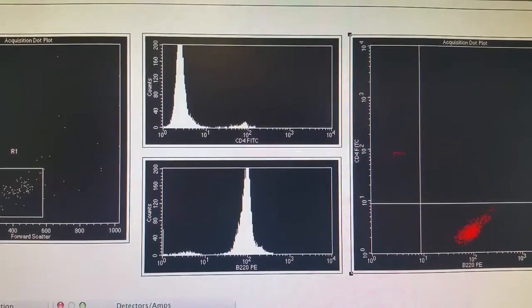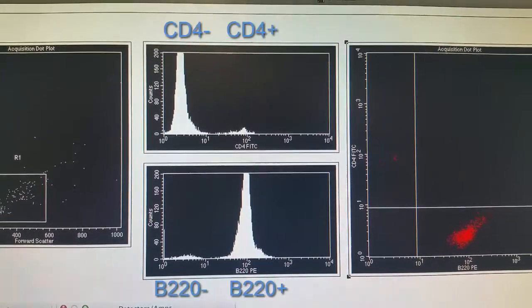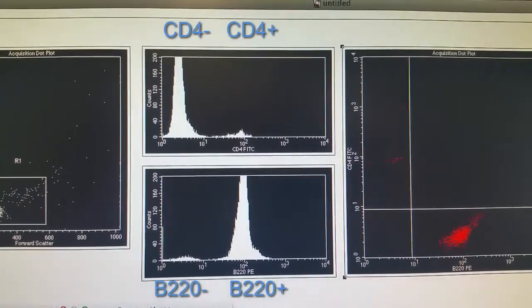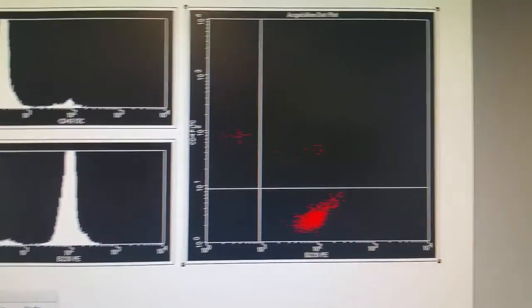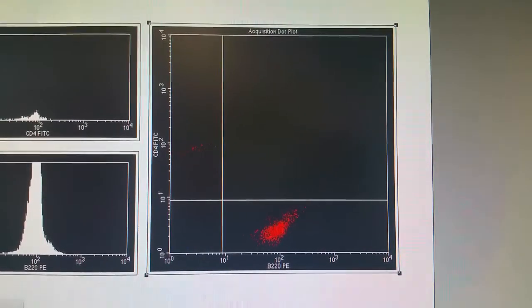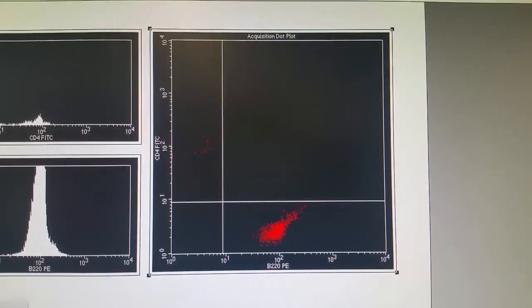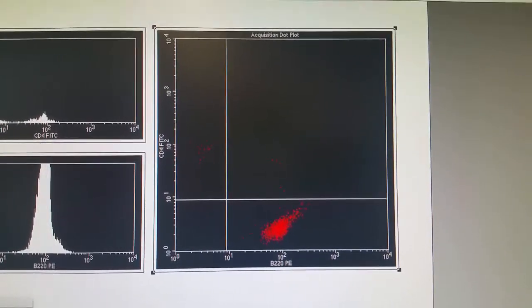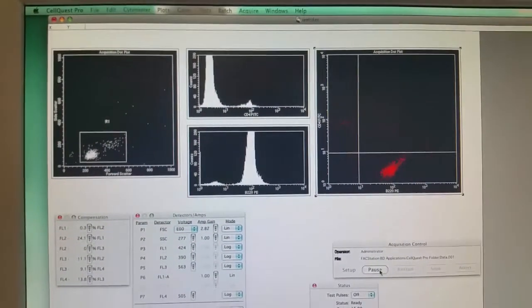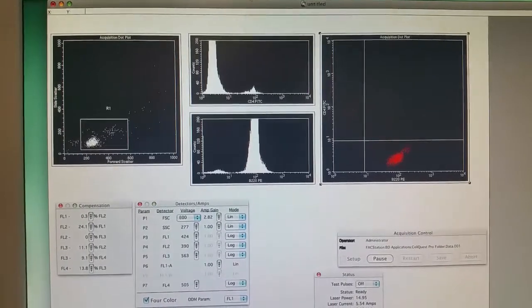If we look at our histograms, we can start to see which cells are positive and which cells are negative for CD4 in the top histogram, or B220 in the bottom histogram. We can also look at our 2D dot plot to see which of those cells are B220 positive, CD4 positive, or positive for both cell markers.